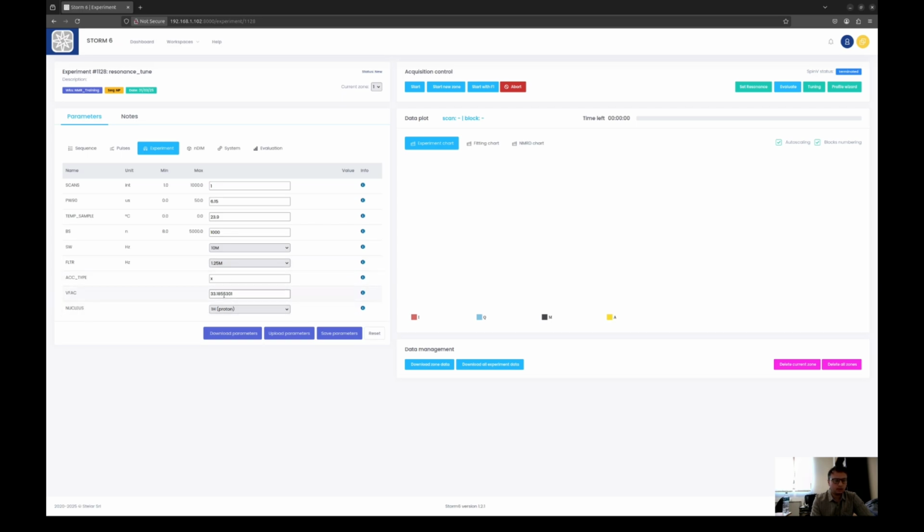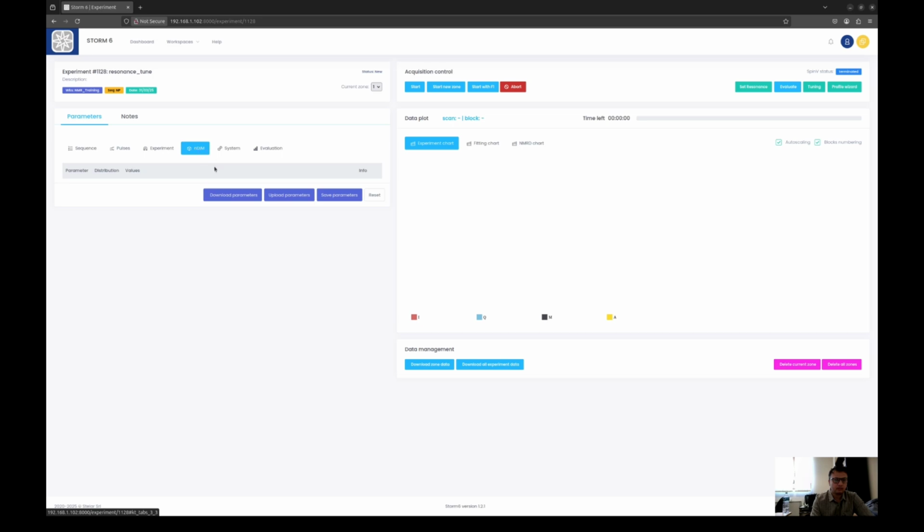And then we have some important parameters related to phase cycling. So let's say we have multiple scans and we want to cycle their phases and accumulate them. With this we can add different scans with each other in different orientations. And this information we can see from here. It tells you we can use x, minus x, y, minus y, and what they basically mean, how they add or subtract real and imaginary parts between multiple scans. So this is useful when we perform multiple scans. In single scans it's not that useful. Then here, this is the part where we basically set the dimension of our blocks.